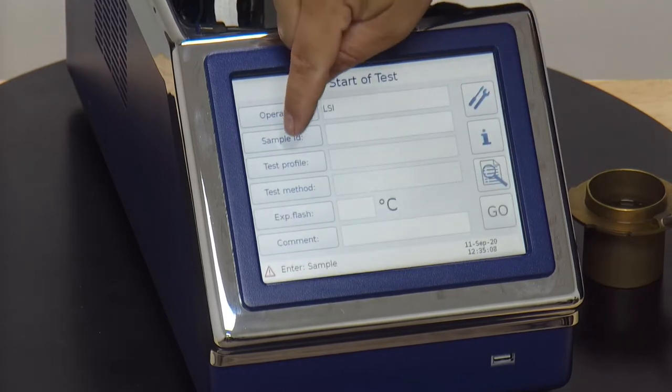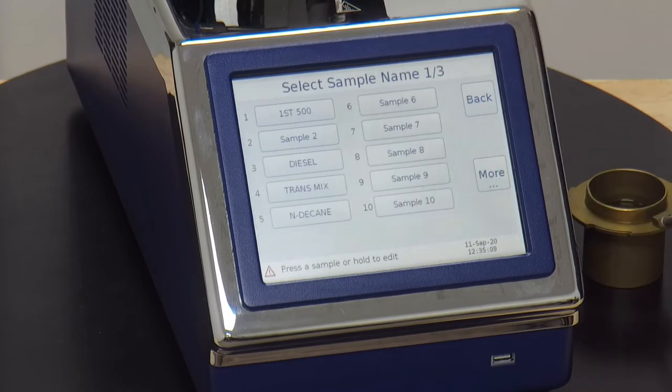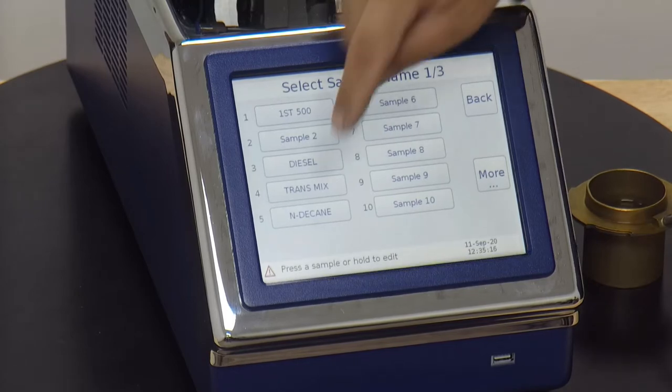Next we'll select sample ID. Again you have up to 30 pre-populated ones that you can select from or type in one yourself. Today we'll be running N-Decane so we'll select the N-Decane.